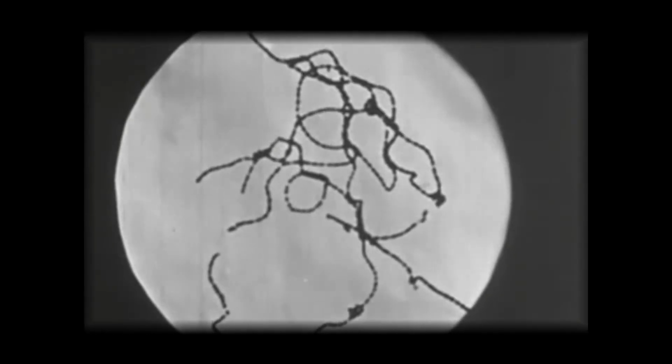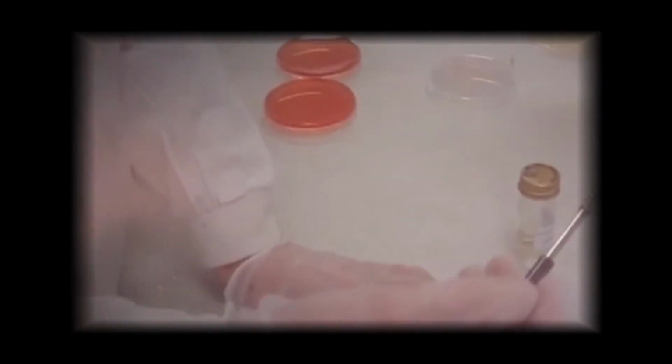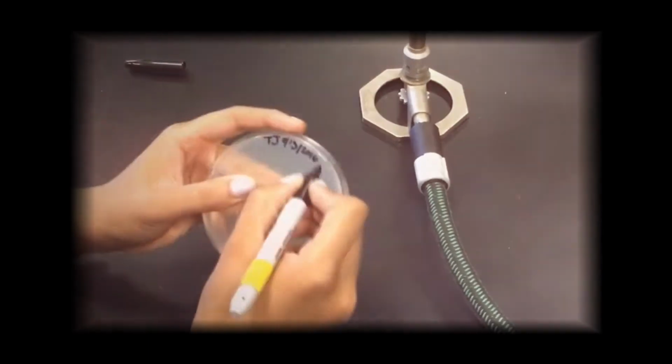Aseptic technique is the use of different routines to prevent contamination of a culture, sterile media stock, and other solutions from unwanted microorganisms or pathogens. On the other hand, the streak plate method is a procedure that uses simple mechanical separation to isolate pure cultures of bacteria or colonies from mixed populations.